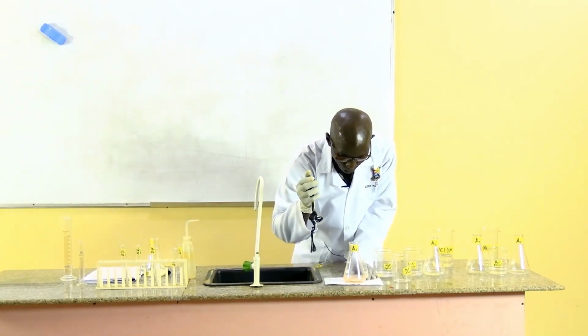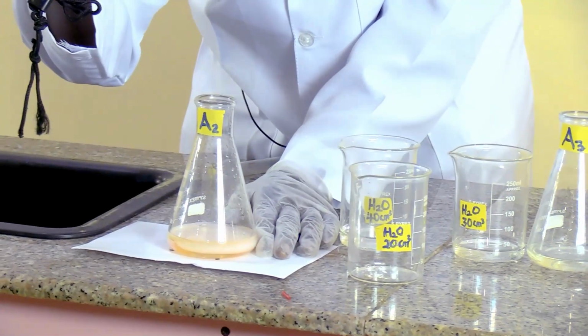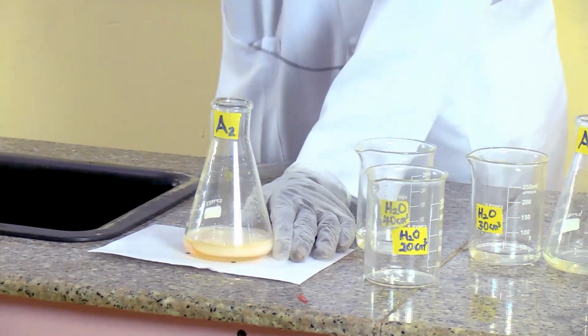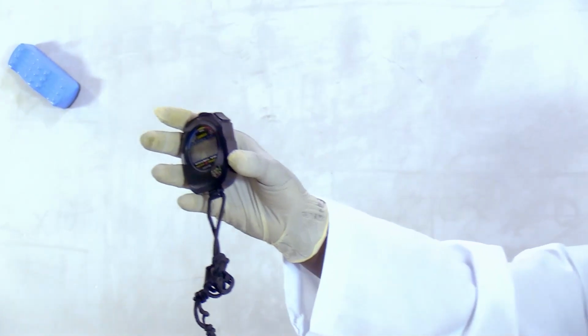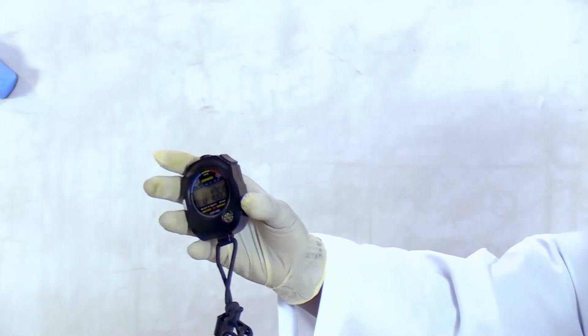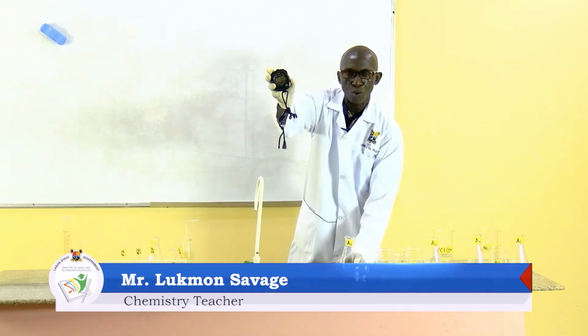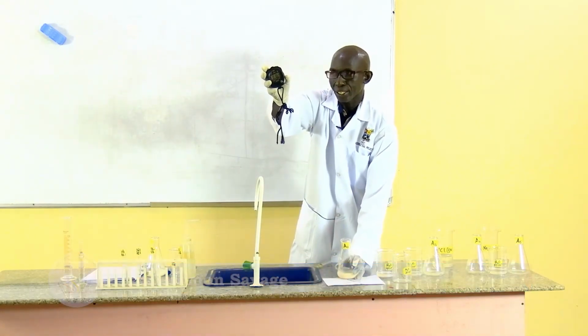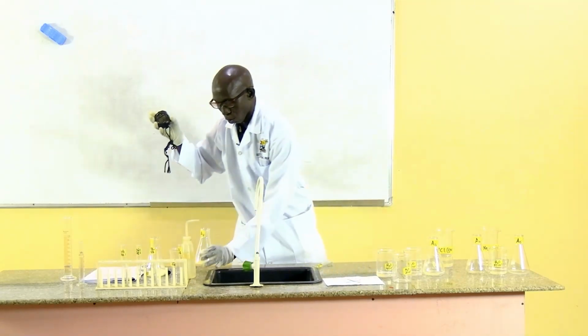The cross is disappearing gradually. Stop. I have 10 seconds here. It takes 10 seconds for the X, that is the cross, the black cross on the white paper, to finally disappear. So that is the time taken for the reaction to occur.